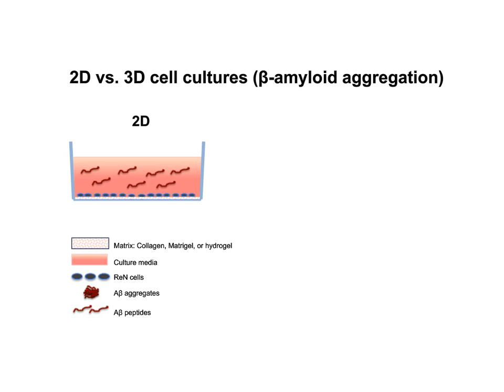So it was very frustrating. But at that point, we thought, maybe it's not just the cell line problems. Maybe it's a system problem. You can easily imagine that every 3 days we are changing media. Which means that A-beta is generally secreted out to the media, and then we take it away. So we are actually getting rid of A-beta every 3 days. And that's probably why A-beta cannot aggregate inside this system.